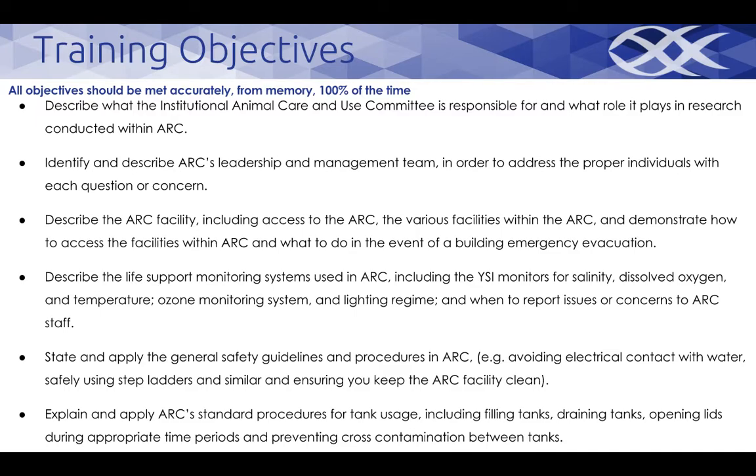Describe the life support monitoring systems used in ARC, including the YSI monitors for salinity, dissolved oxygen and temperature, ozone monitoring system, and lighting regime, and when to report issues or concerns to ARC staff. State and apply the general safety guidelines and procedures in ARC, for example, avoiding electrical contact with water, safely using stepladders and similar, and ensuring you keep the ARC facility clean. Explain and apply ARC standard procedures for tank usage, including filling tanks, draining tanks, opening lids during appropriate time periods, and preventing cross-contamination between tanks.